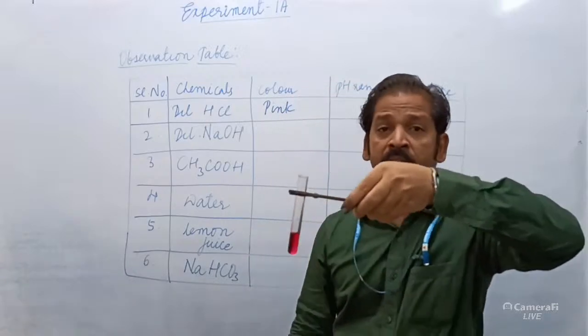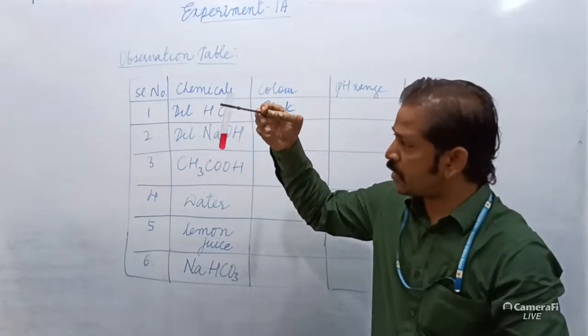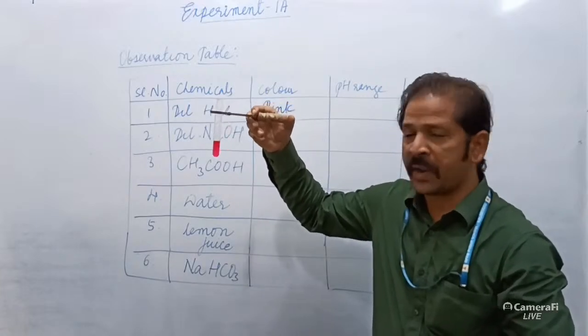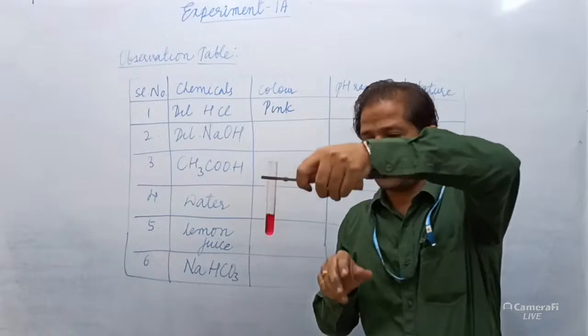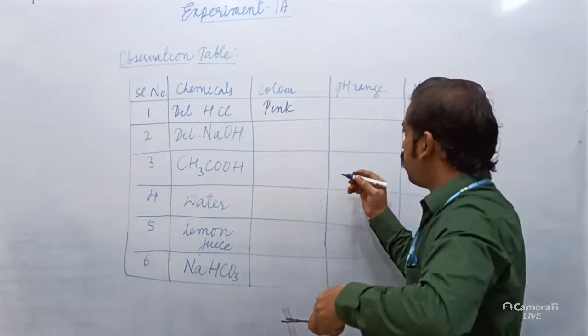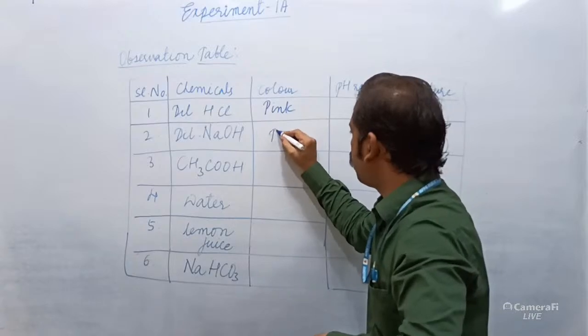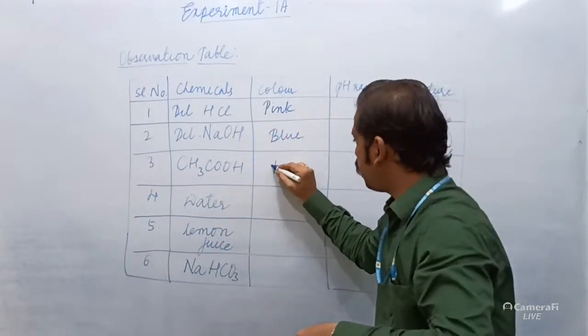Yes, it is concentrated acetic acid, so the color is almost pink. The color is pink. I got one more color. The second one was blue. The third one is once again pink.